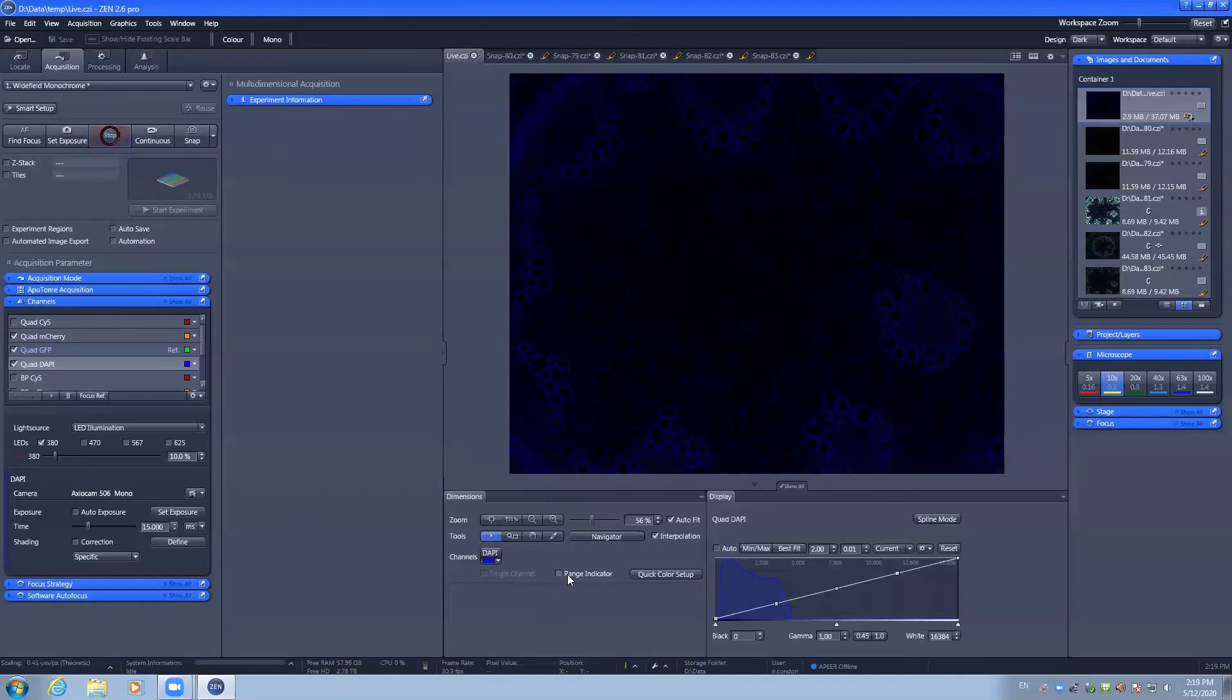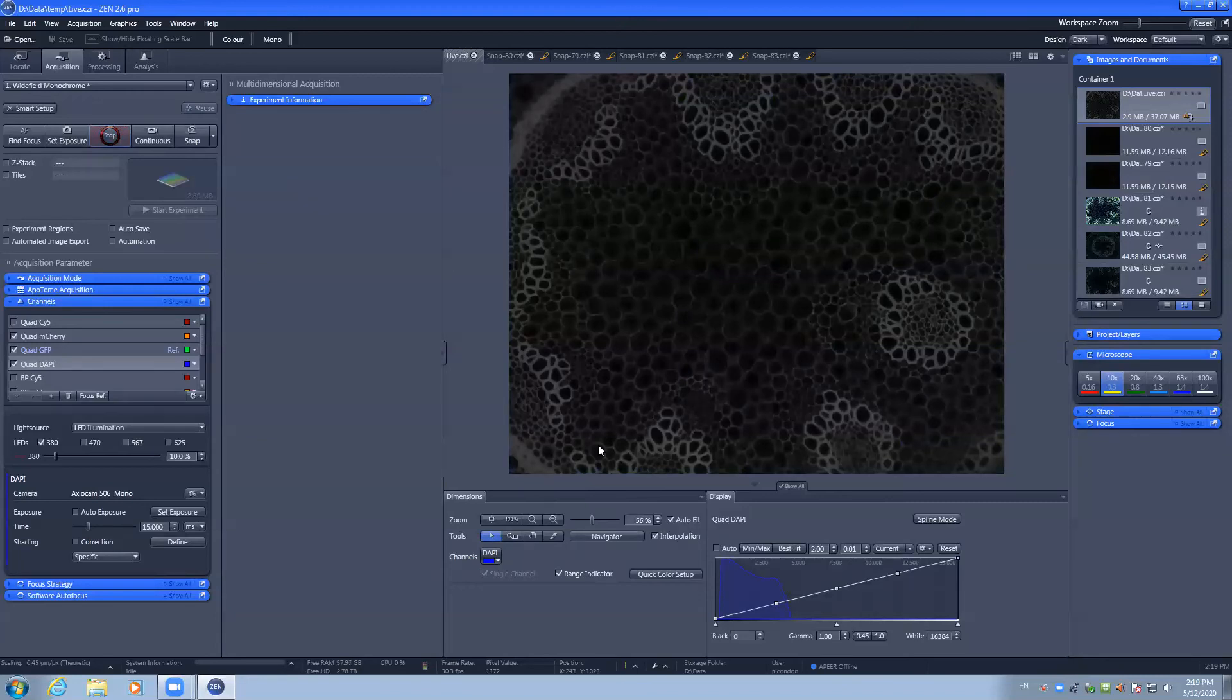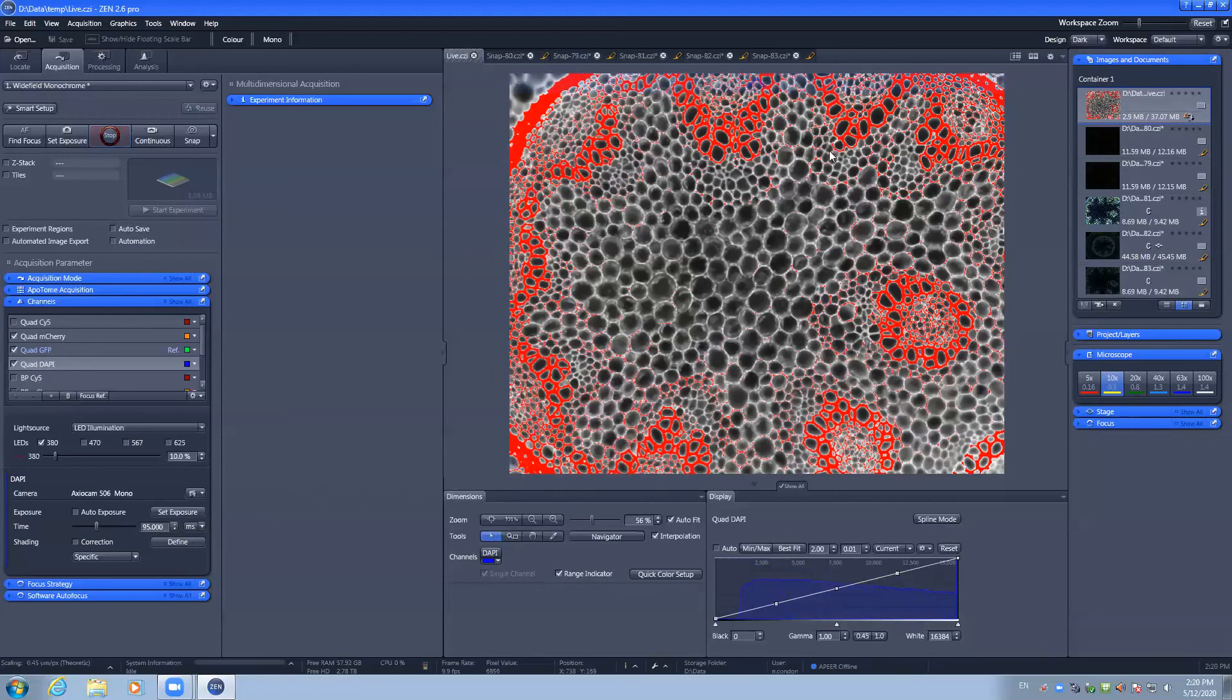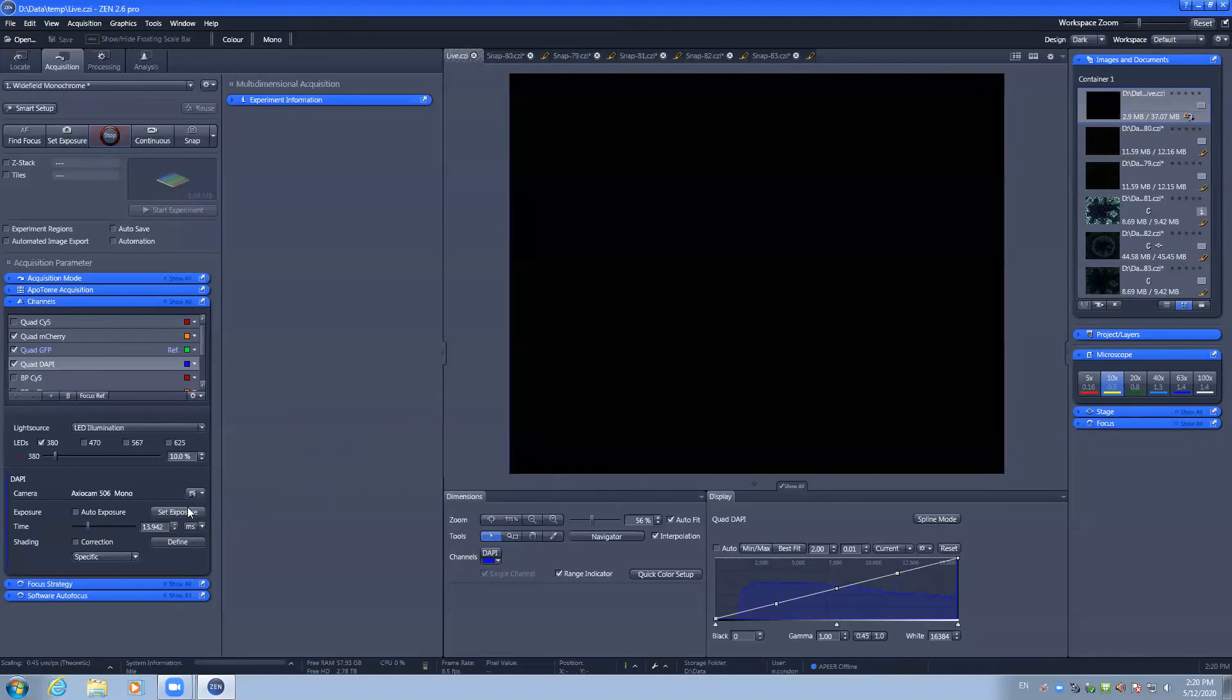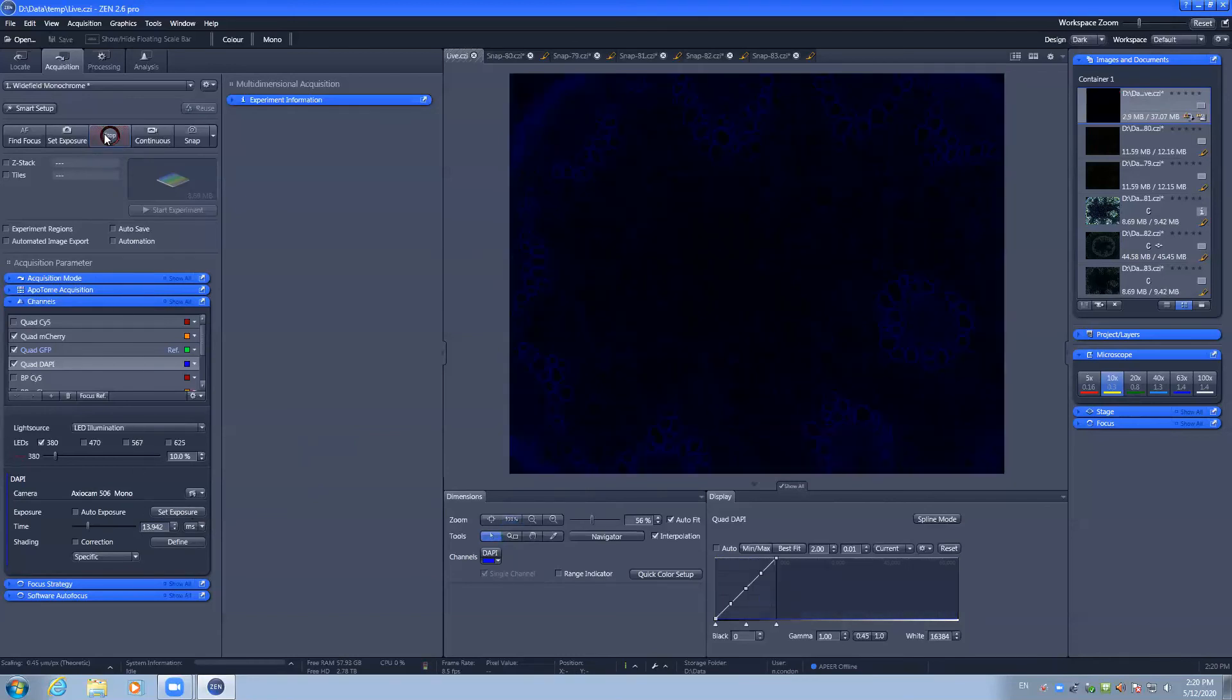You can also use the range indicator to change the lookup table from, for example, blue to a now grayscale lookup table where saturated pixels will be displayed red. We increase our exposure time where we have saturation, we can easily see these red pixels being displayed. We can use a set exposure here to manually set the exposure. We can restart our live capture and we can adjust that to a more round number.